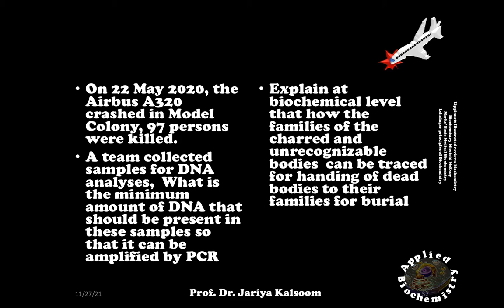The process of creating a DNA fingerprint is as follows. First, DNA is extracted and purified from the sample, which may be muscle tissue, bone tissue, or dental tissue. In this case, for RFLP analysis, the purified DNA is cut at specific points with the help of restriction enzymes. The fragments of different lengths which are obtained are placed on a gel and the gel is subjected to electrophoresis. The shorter the fragment, the quicker its movement towards the anode.